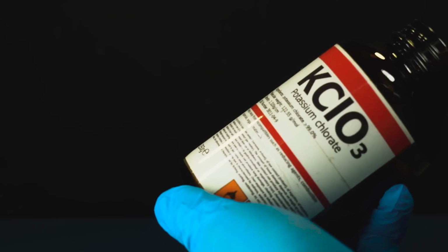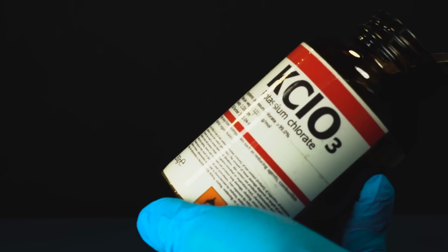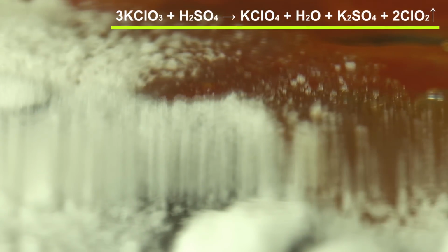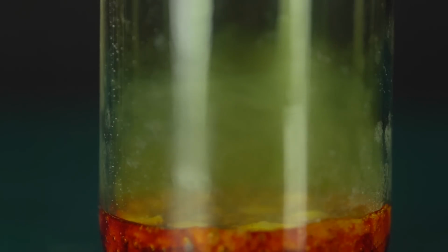A bonus dangerous reaction: sulfur solution in carbon disulfide and chlorine dioxide vapors. I chose this reaction because elemental sulfur reacts with chlorine dioxide on its own. Chlorine dioxide is a very unstable material, so the concentration of it should not be high for the experiment.